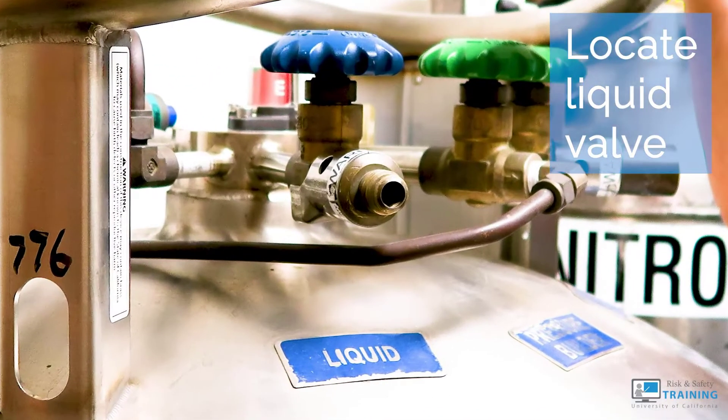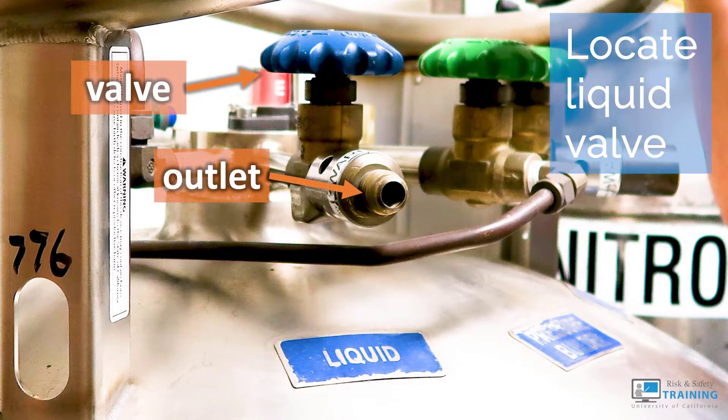Locate the outlet valve on the source labeled liquid. This is a CGA fitting with rounded threads.